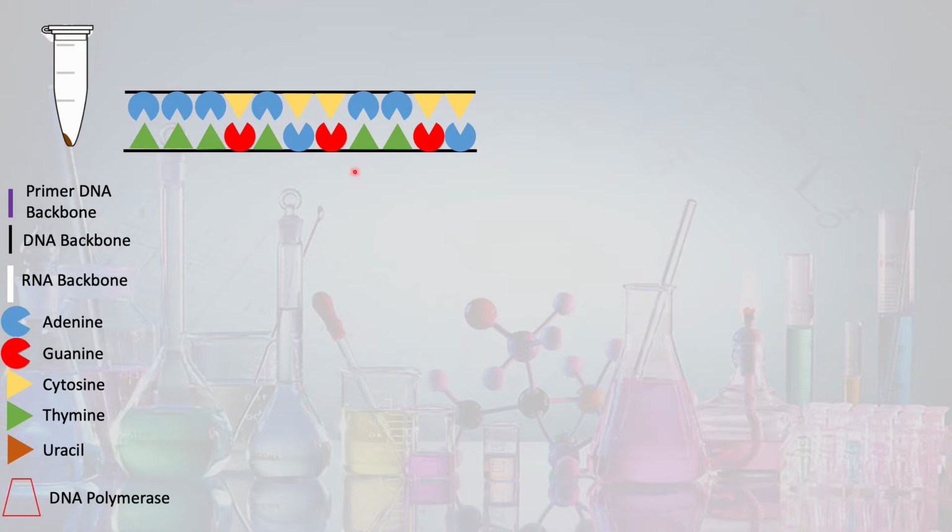I've taken the liberty of just cutting out that process, but know that this process occurs with a normal, quote-unquote, normal double-stranded DNA segment. So again, the only DNA present in our samples now have been generated by copying, reverse transcribing, rather, all of our messenger RNA from our samples. We've left all the other forms of RNA behind.